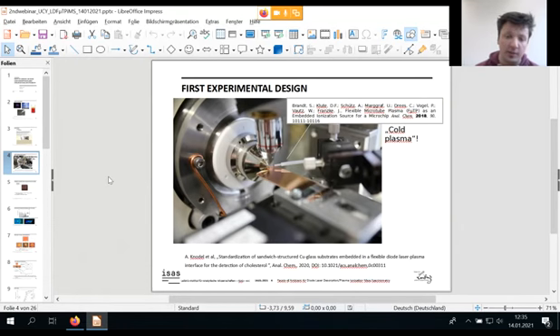It's not as good as with Nd:YAG lasers, for instance, because it's a laser diode and has high divergence, but it's definitely possible to some extent to focus it using anamorphic prisms and this objective. Okay, thank you.